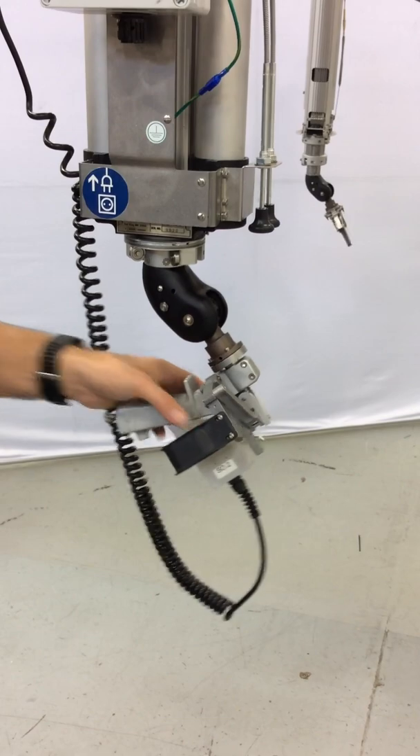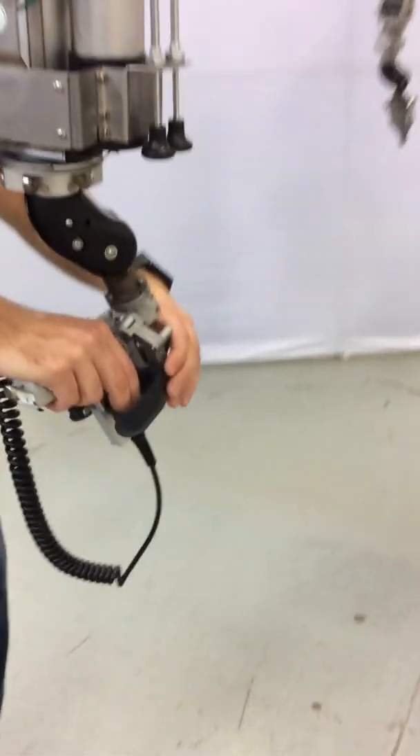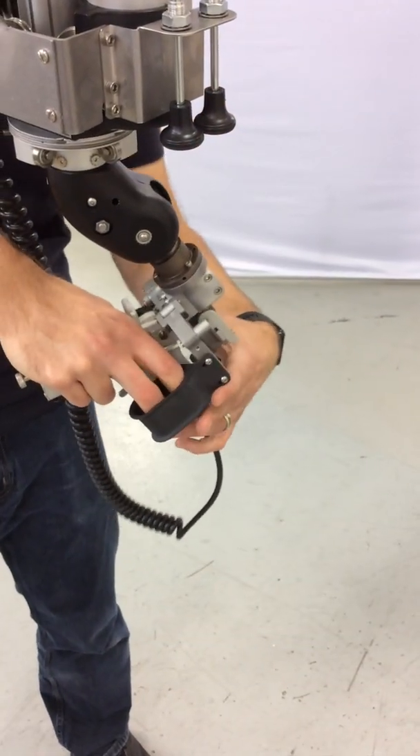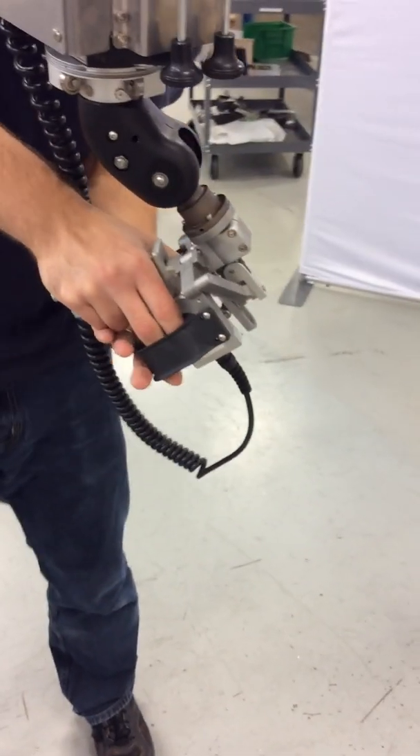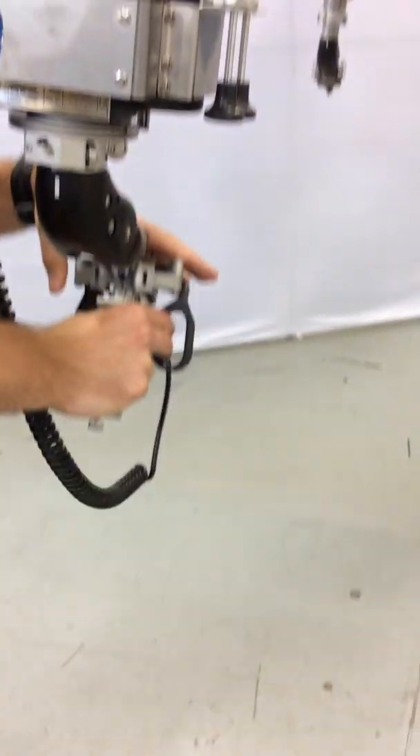You may also use your second hand to assist in squeezing by holding from the top, from the front, from the bottom — however it is most comfortable. Every operator will be slightly different.